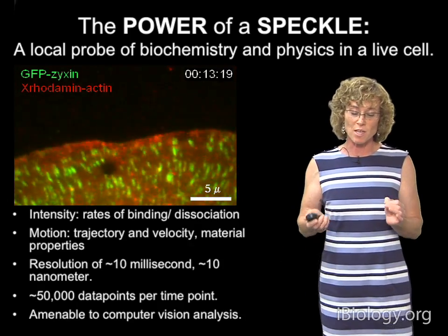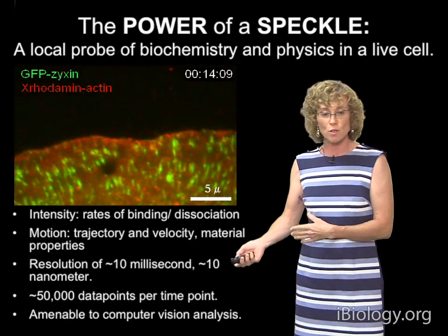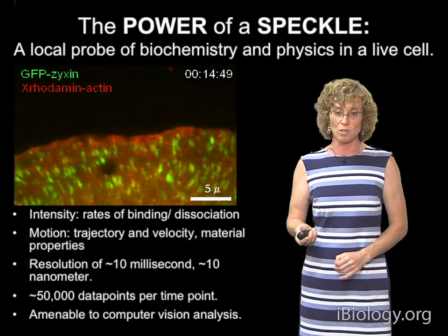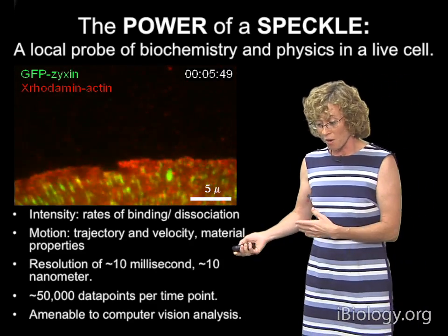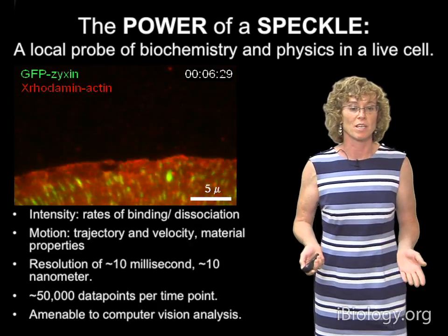The information density is huge, 50,000 speckles per time point over time, so it's really a remarkable technique. But you give that to a graduate student to track, they're going to commit hara-kiri.